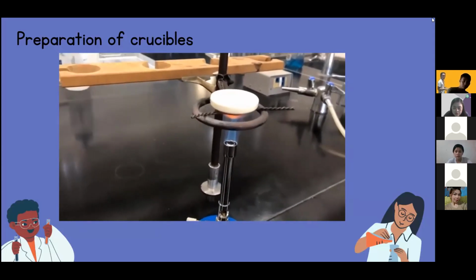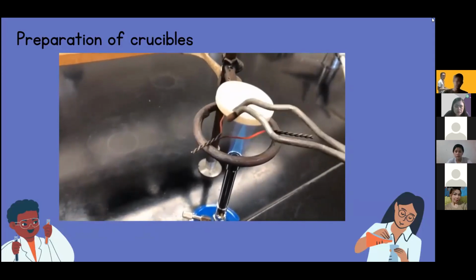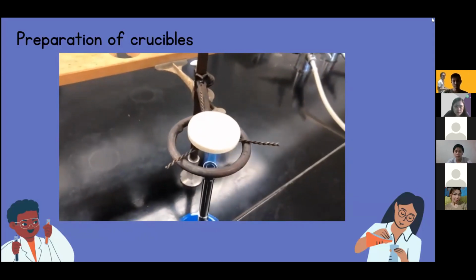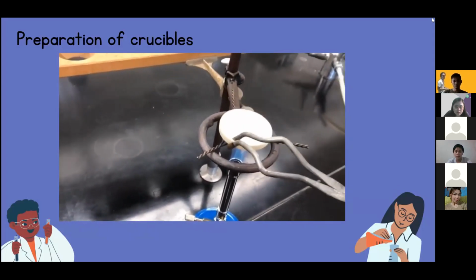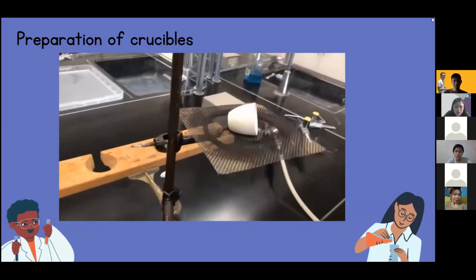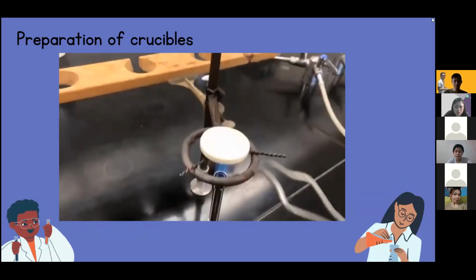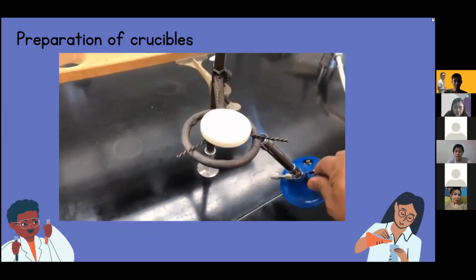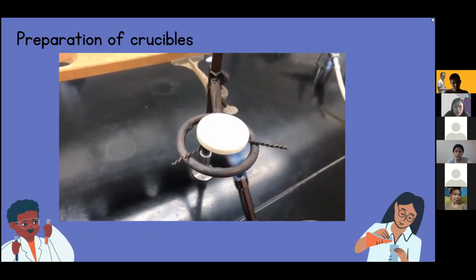But we're going to heat this lid, and then when it's all done, we'll weigh these two together. It's okay, by the way, if you can't get the material off of here and you're afraid you're going to spill it, to weigh the lid and the crucible separately, although we prefer to weigh them together, but you can weigh them separately and add their masses. But again, like I said, you may have to pick your Bunsen burner up to heat spots that aren't accessible.